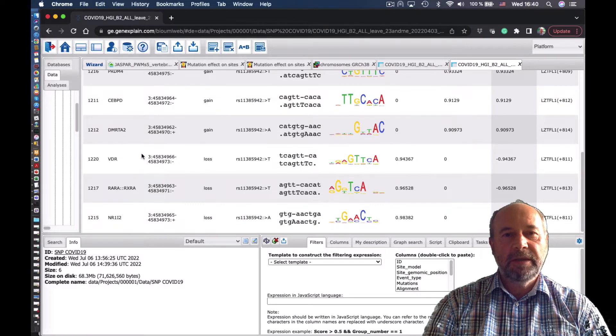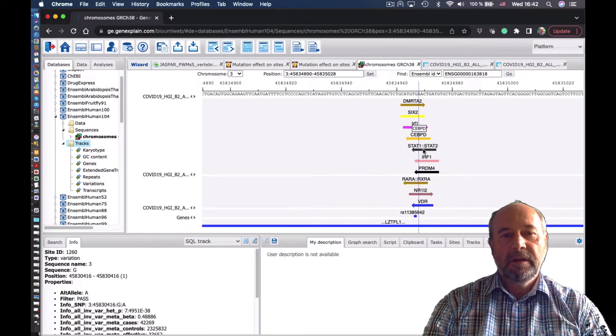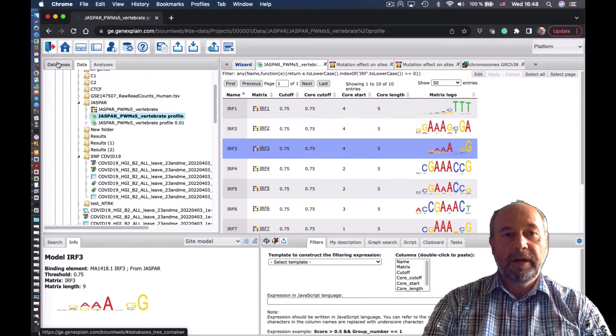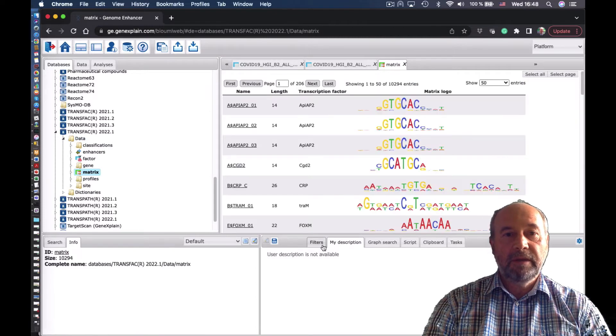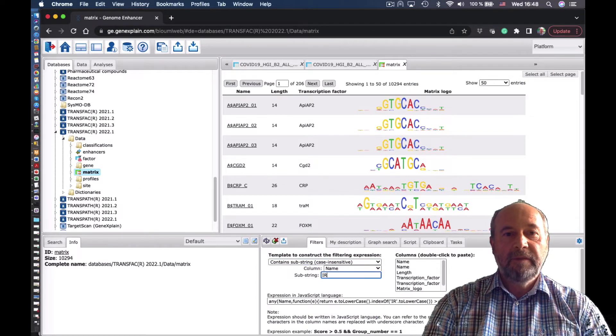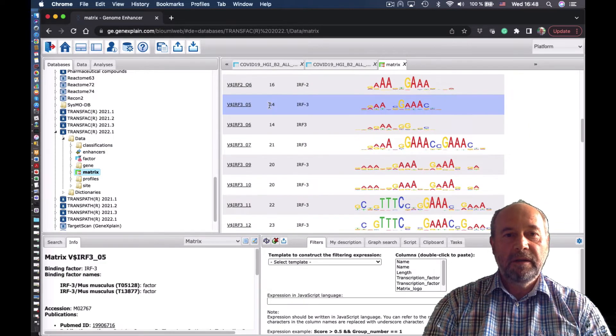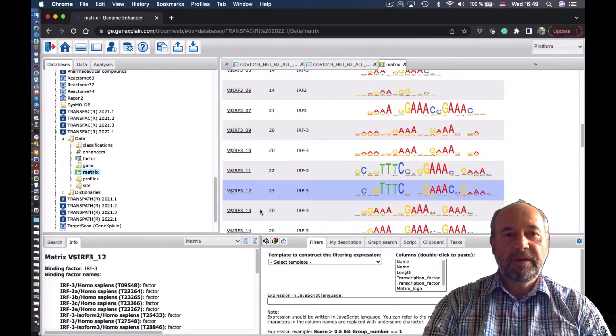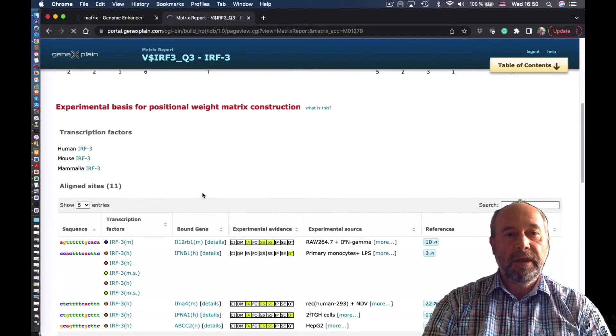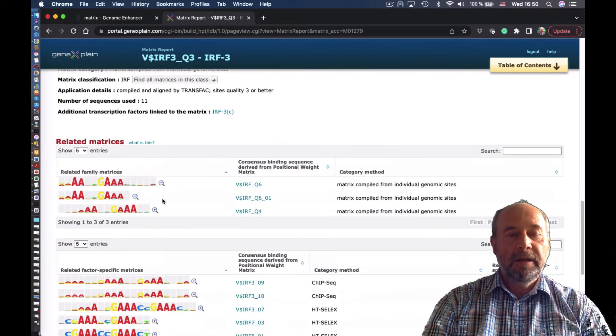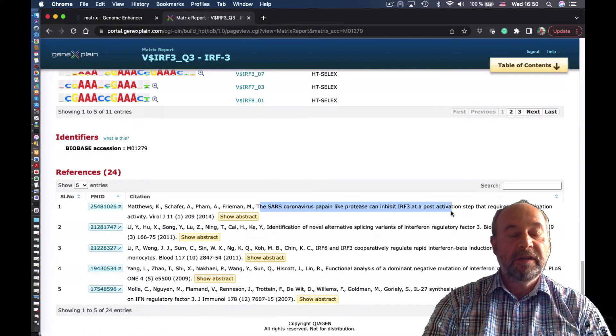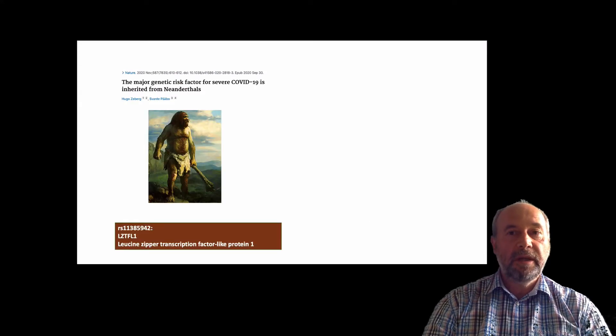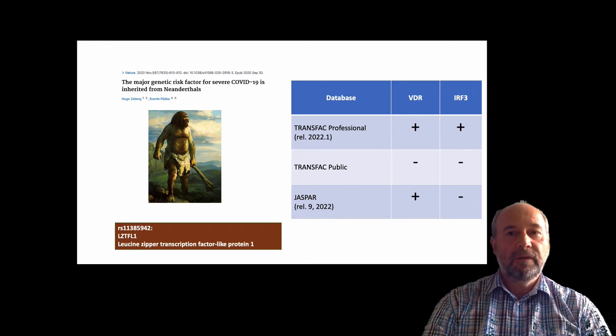Jaspar database is quite reasonable and we actually found VDR site, but what about IRF3? There is no IRF3, so we cannot find IRF3 using Jaspar. The reason is because in Jaspar you have just one matrix for IRF3. Whereas in Transfac, you see how many positional weight matrices collected from different papers are for IRF3. Let's have a look at that matrix which was found in the SNP. Interestingly, this matrix was built by our team and it was built using information from binding sites from SARS coronavirus infection. That's why it was probably found in this case, but when we used just one matrix from Jaspar, it was not possible.